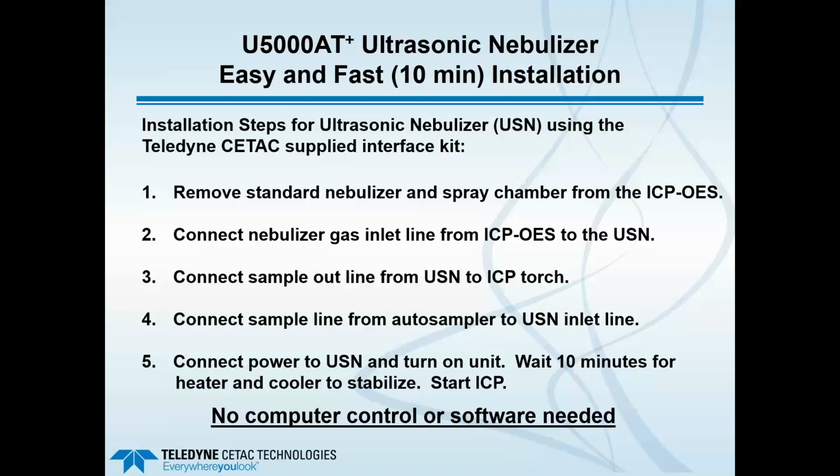The other things that would normally be under computer control stay under computer control, that being the host peristaltic pump that's built onto the ICP, and if in use, the autosampler. So that doesn't change. The ultrasonic nebulizer is just another accessory through which to pump sample solution.